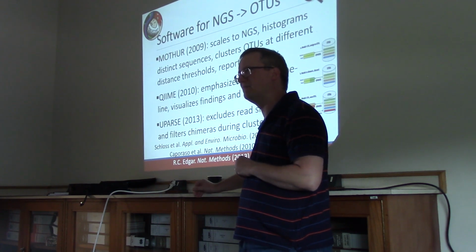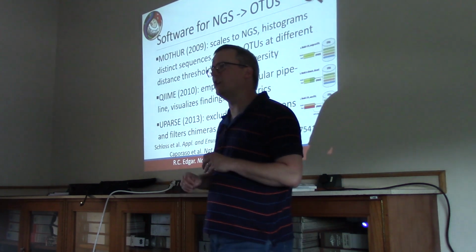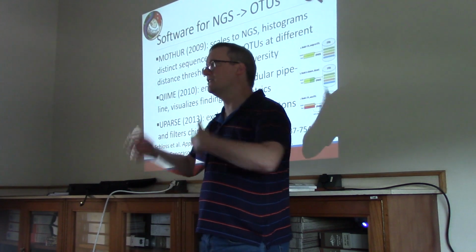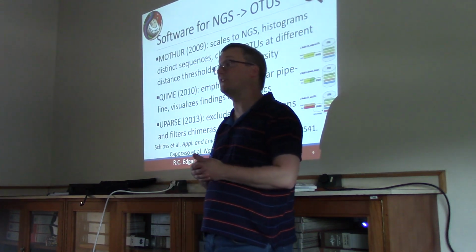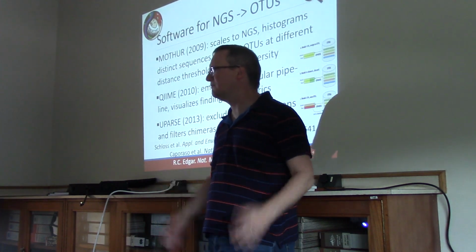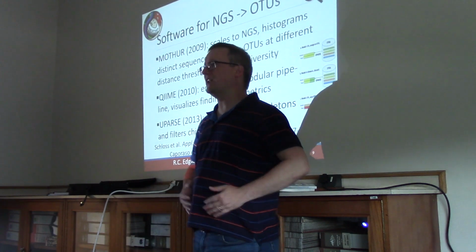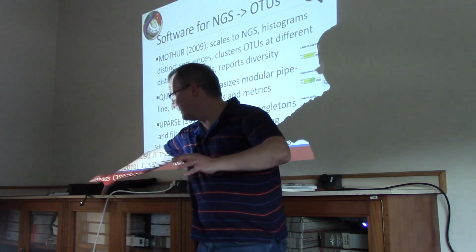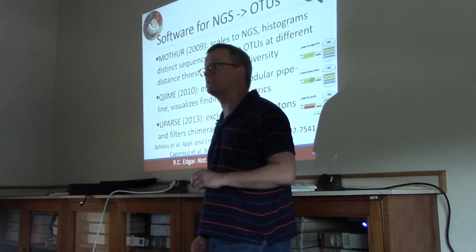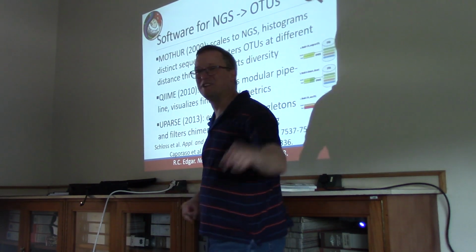chimeras during clustering. Do people know the word chimera? A chimera, well, in the old days, would be a mythical beast that combines multiple animals within it. So the Sphinx, right? Human face, body of a cat, right? That's cat. How about a centaur? Body of a man with the backside of a horse. My father occasionally called me the backside of a horse, so maybe I'm a centaur, right? I'm just kidding. All right, Dad would laugh at the joke.